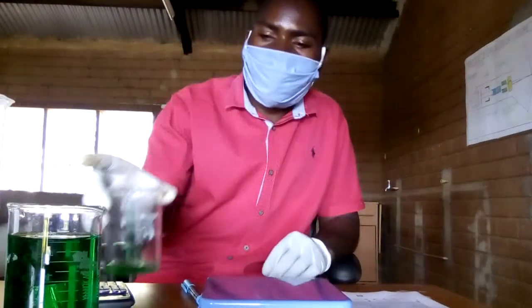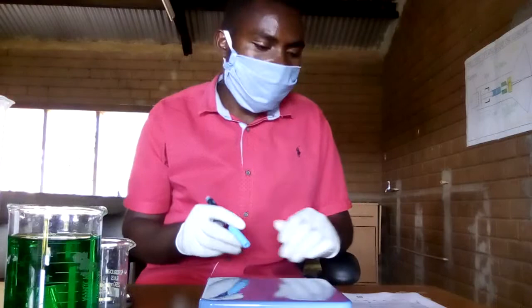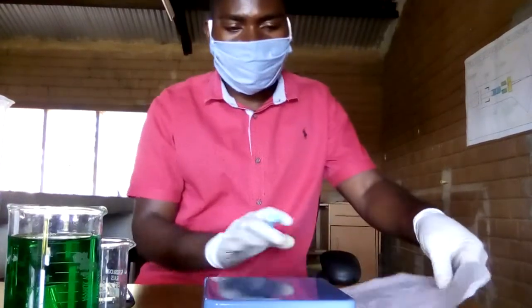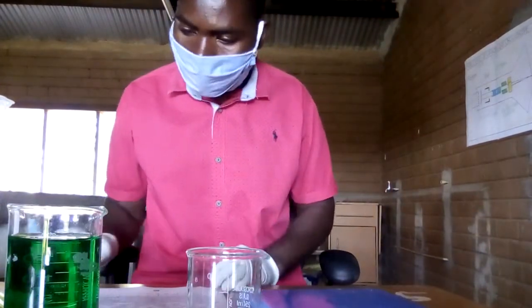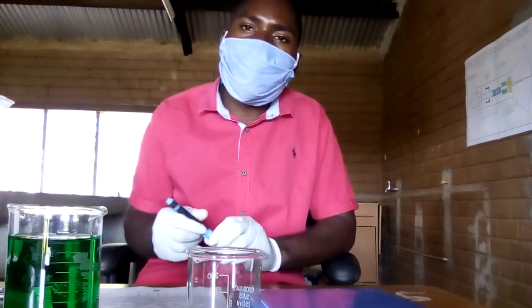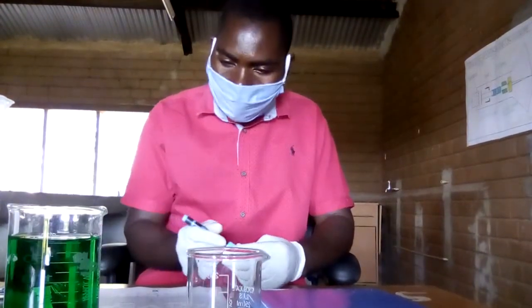So when you do this, you now need to use the formula to find the mass of liquid P. How do you do it? You're going to subtract the mass of the empty beaker from the mass of the liquid plus the beaker. With me, the answer I've gotten is 11.3 grams.